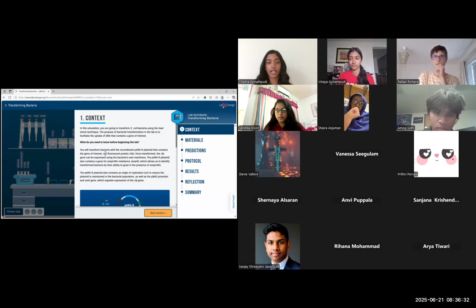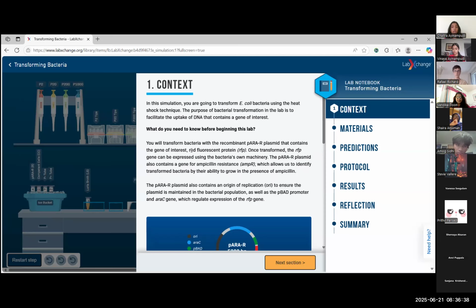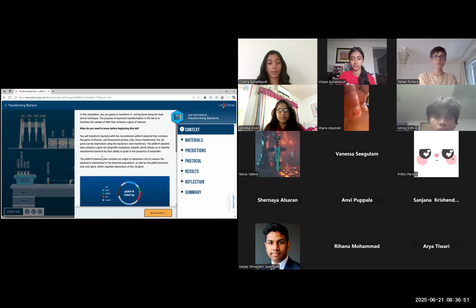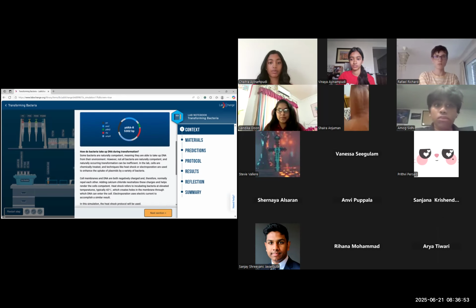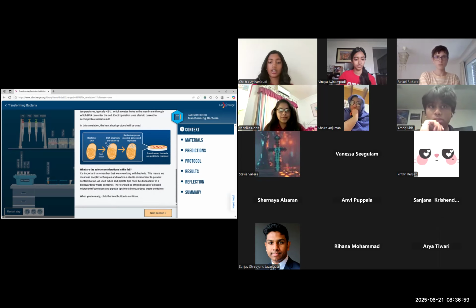Right now, the context is just what was explained in the presentation. We are going to be transforming E. coli bacteria using a heat shock technique, and we're going to be using P minus and P plus components, and then we're going to be adding plasmid to only the P plus tube. I'll give you around a minute if you want to read this.